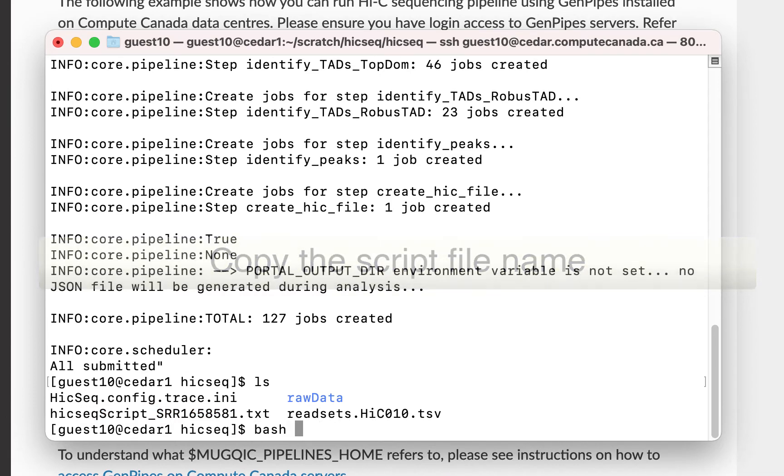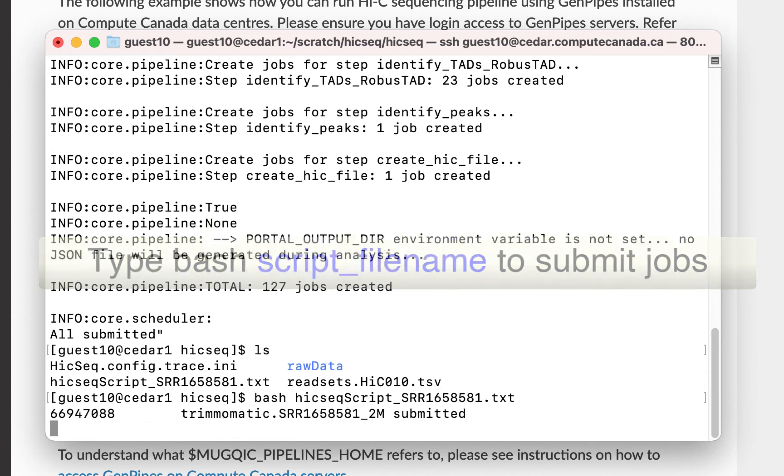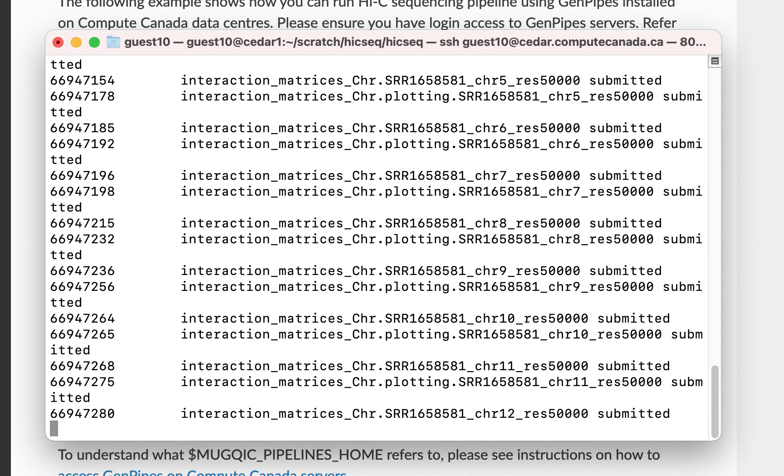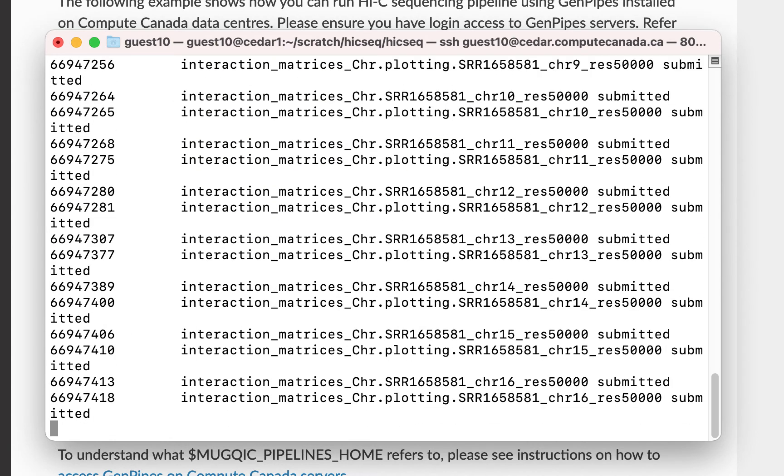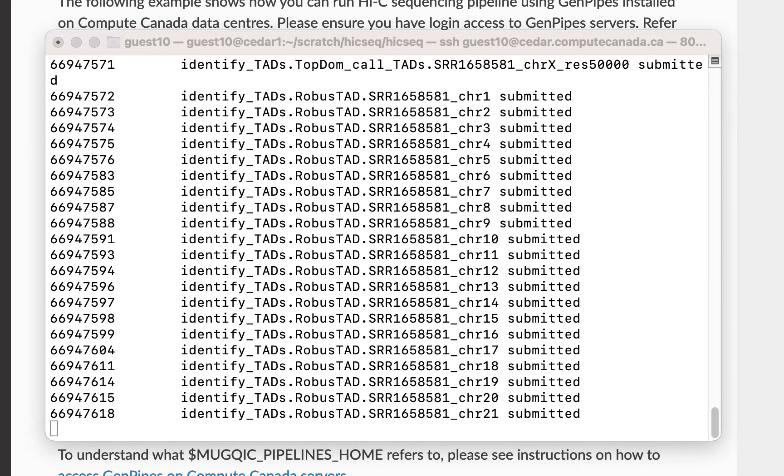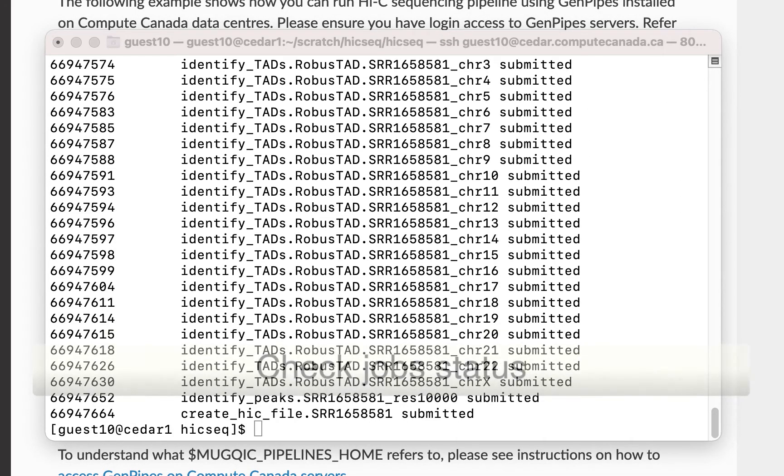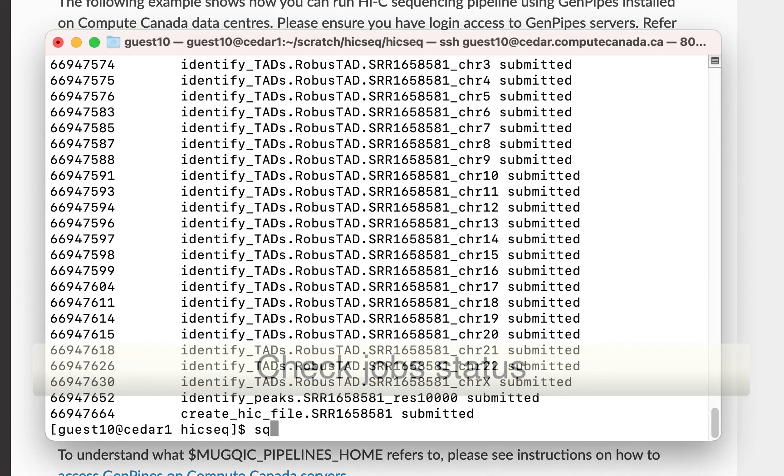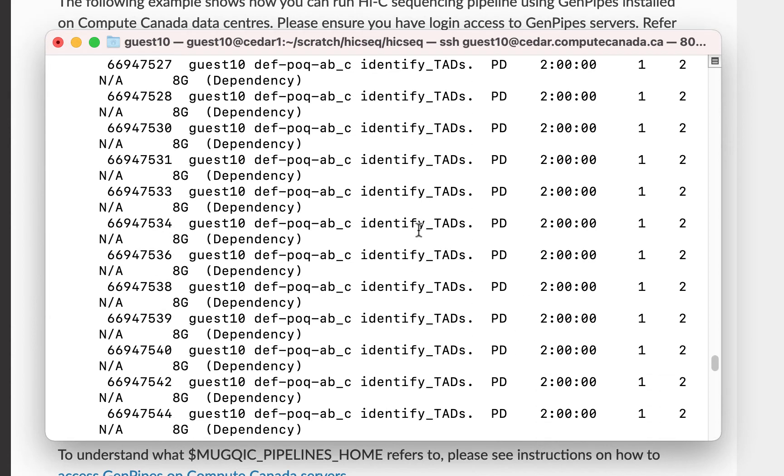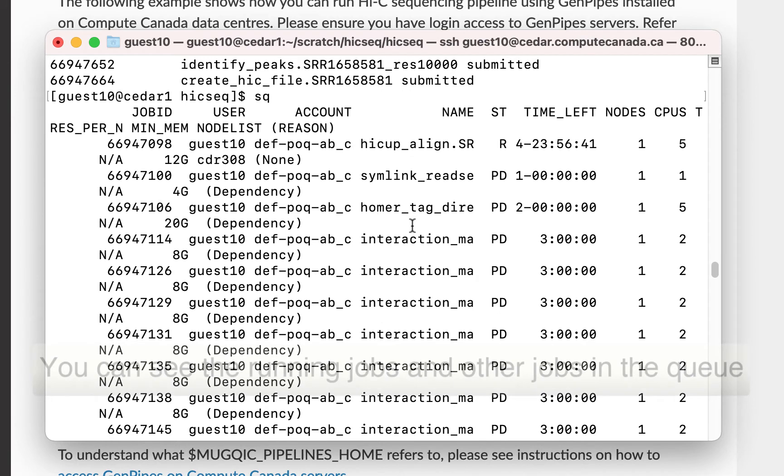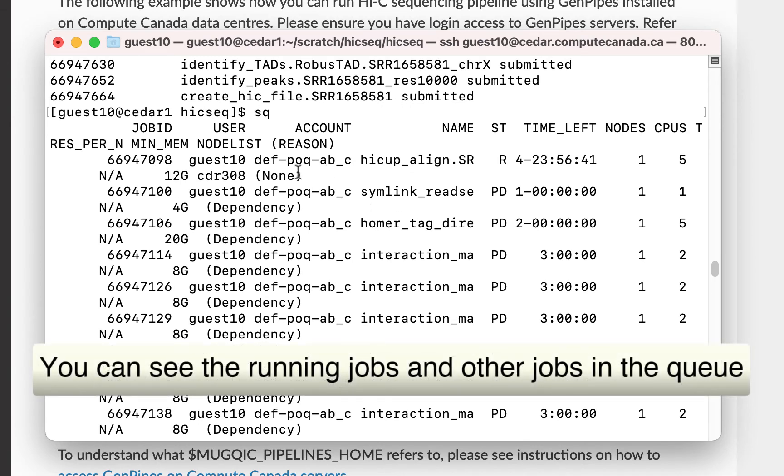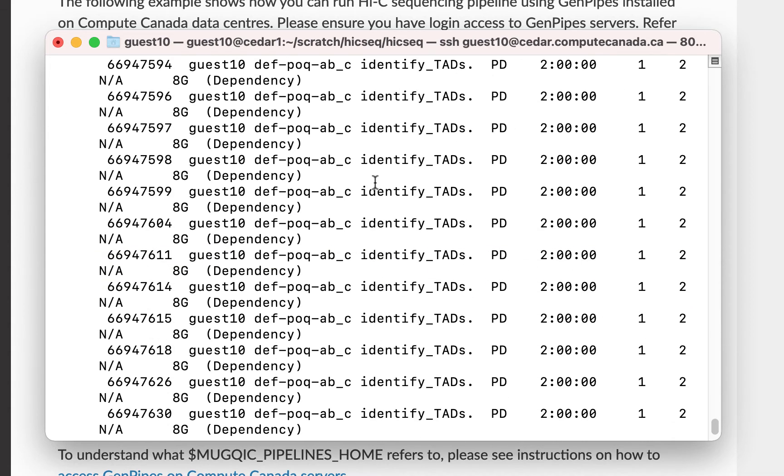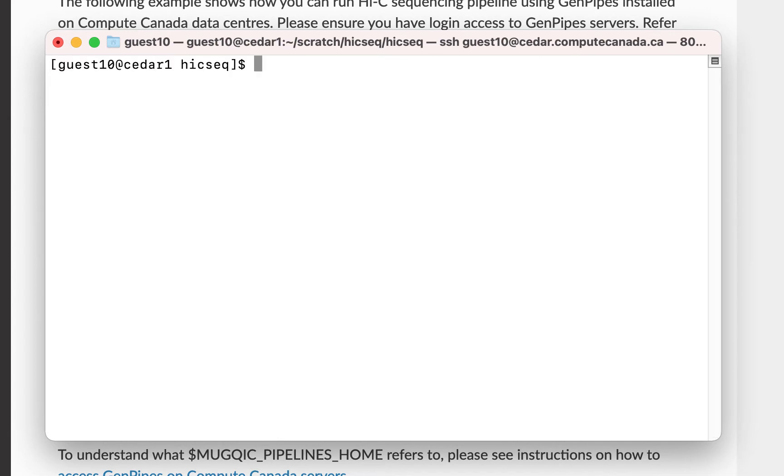Let's submit the jobs. All the jobs have been submitted. Let's check the status of these jobs by typing SQ. You can see the status of each job here. For example, whether they are currently running or not.